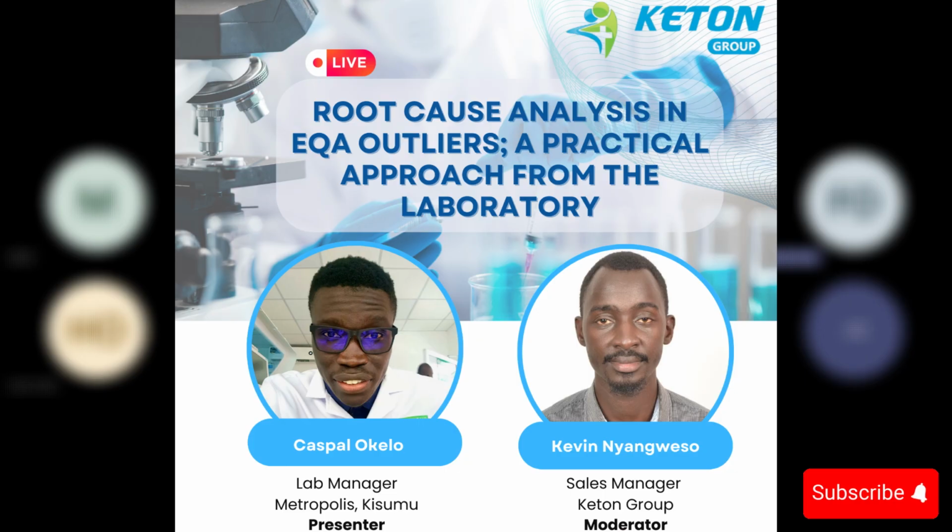Just a comment regarding the issue somebody asked about, LJ chart plotting. You talked about the moving mean and the fixed mean.